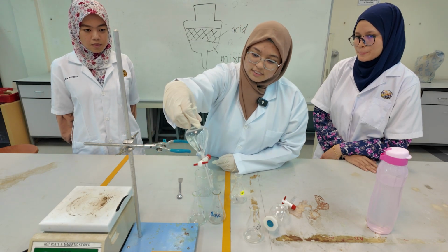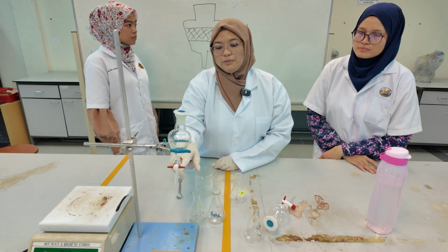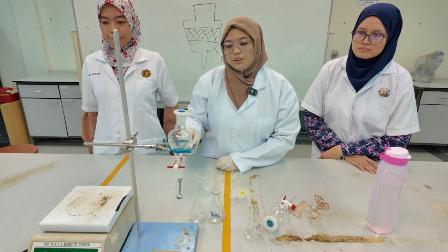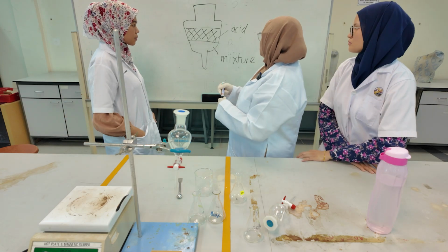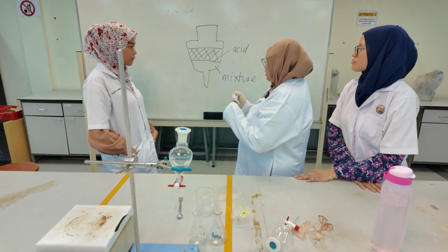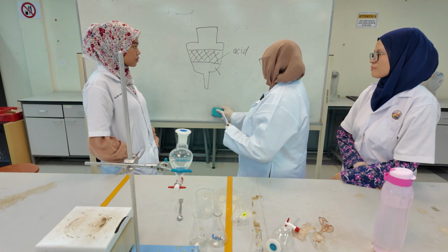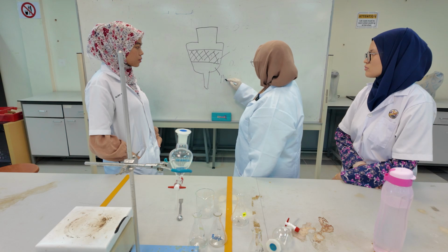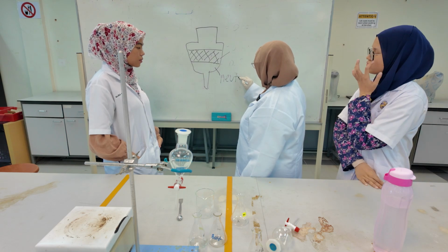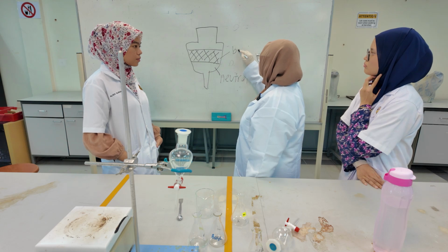What we're left with is two layers. It's no longer a mixture, but instead a neutral. The bottom layer is the neutral, whereas the upper layer is the base.